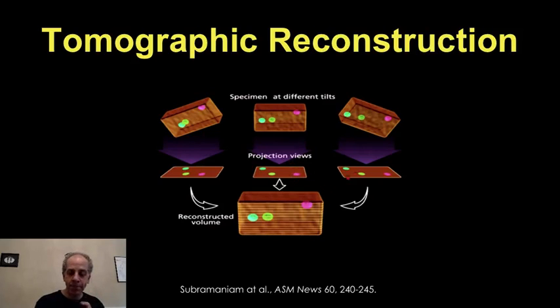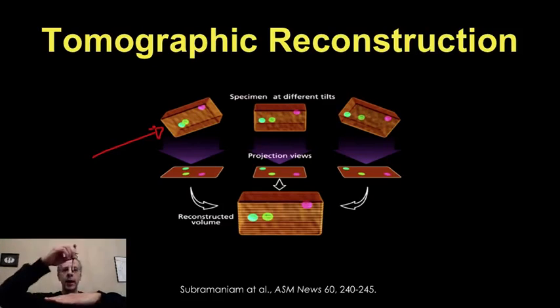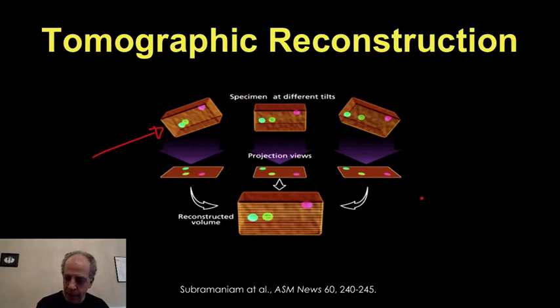Now, there is one thing that I want to explain here. When you're doing the projection, you can see this is very thin. So I'm illustrating it much wider. We're talking about very, very thin. So when you do cryotomography or cryomicroscopy, you have a very thin slice at cryo temperatures. So if I do the projection and I throw electrons from here, you're not going to get a lot because it's very, very thin. So look at my hand now. It's okay to have electrons going like this, but not going like this, okay? So if I have something very, very thin, I can just do this.